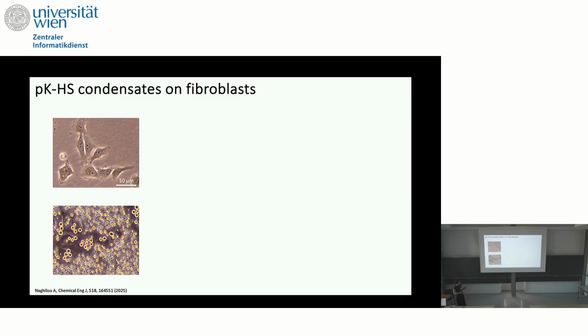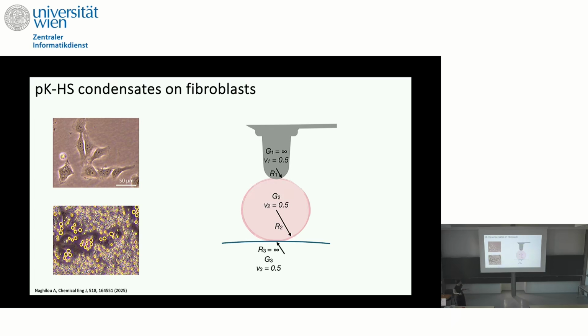And then I wanted to again measure the mechanical properties of the condensates on the cell. And this was the moment that we started thinking, okay, when we are using the Hertzian contact models, like we did for the experiments I already showed you, it actually assumes that the G of your probe and the G of your surface is infinitely times harder than the material you're measuring, which in this case is not true.